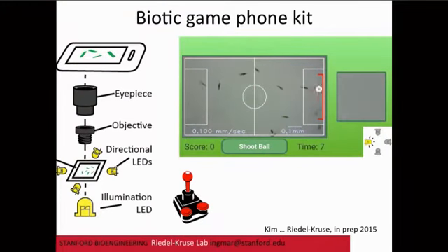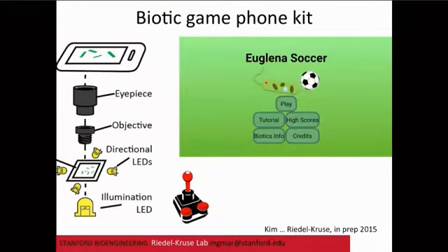Right now this cell is tracked, and then you see the real-time velocity. You also see that whatever cell is tracked, the cell is enlarged. And so the idea is, while you play with these things, there are many subtle ways you can convey to the learner or the player things that are relevant about biology, right? And which you would not get if you played a purely electronic version of that.